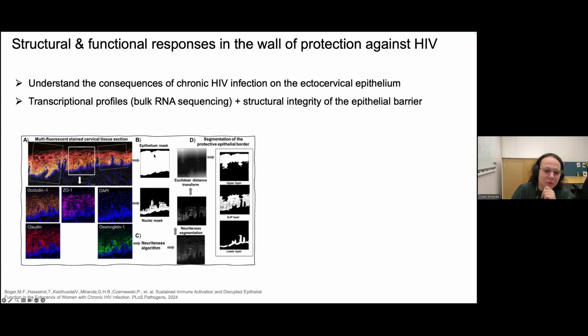So first, we need, of course, to separate the epithelium in relation to the other tissue here. Then again, we use a distance transform to separate first the three layers. So we have the upper layer, the intermediate layer, and the lower layer, and other intermediate steps. So each of the channels here will give us a specific part that is part of the whole pipeline.